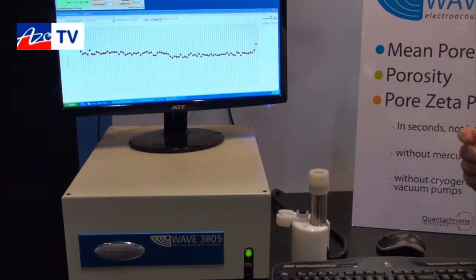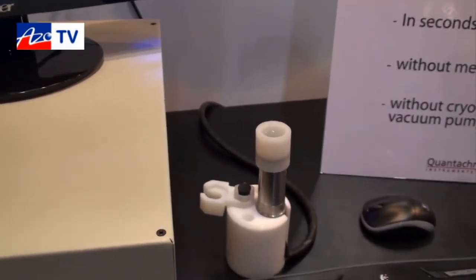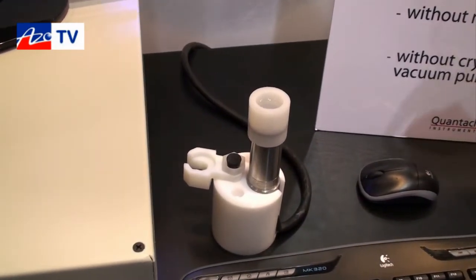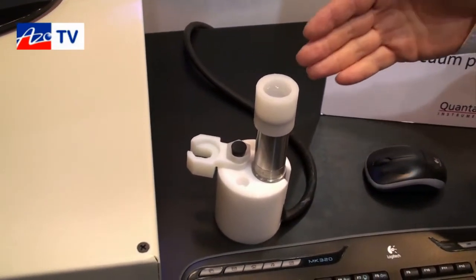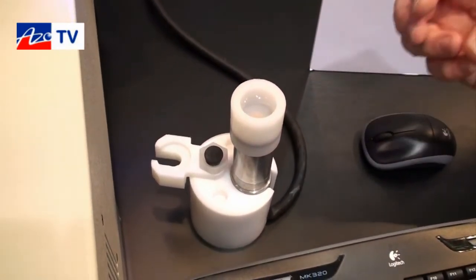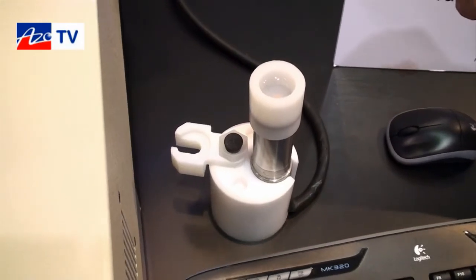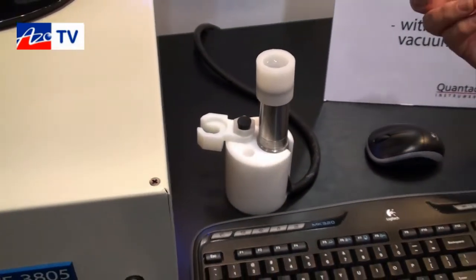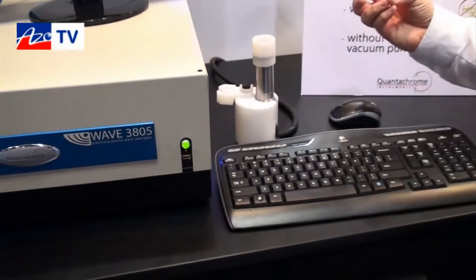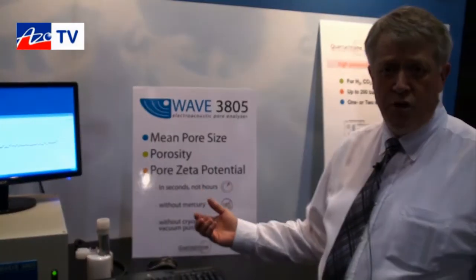Sample preparation is simplicity in itself. All we have to do is wet the sample with a suitable liquid — it could be water, as in this case, or it could be alcohol or some organic. It's put into this sample cup, at the bottom of which we have a special electrode that imparts a high-frequency ultrasonic wave into the sample. That ultrasonic wave then produces an electronic signal, the magnitude of which corresponds to pore size — so the larger the signal, the greater the pore size.